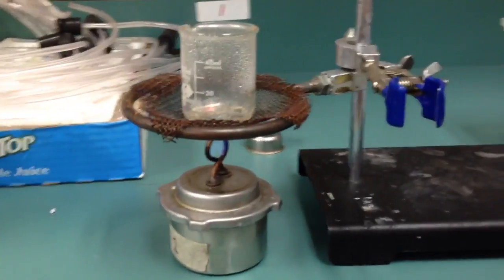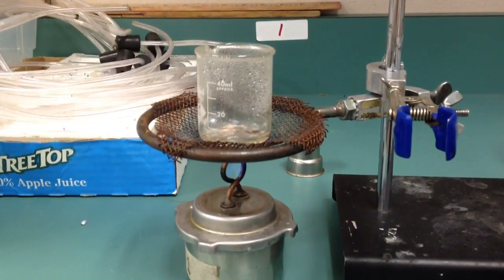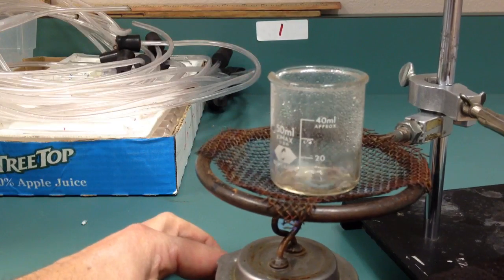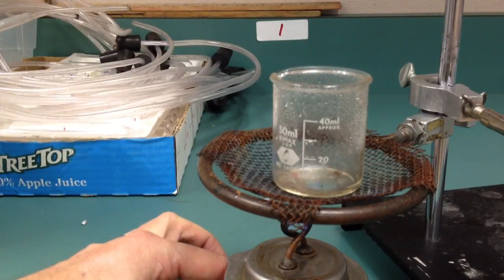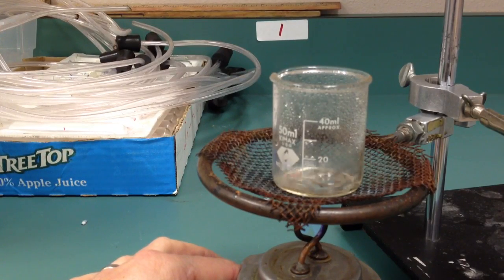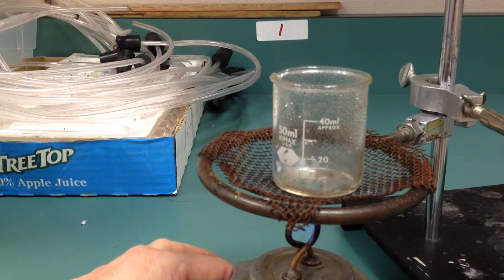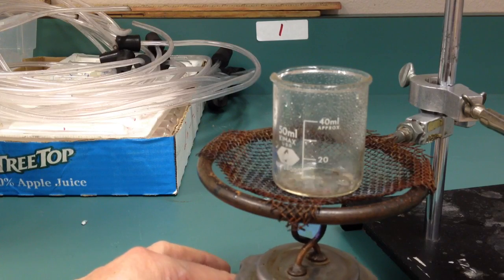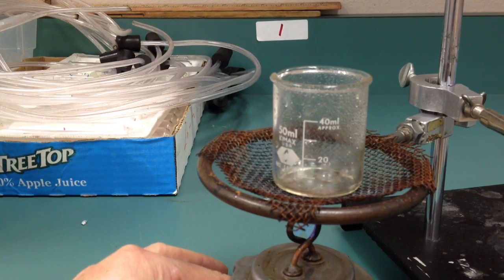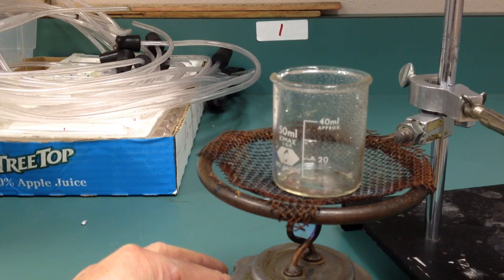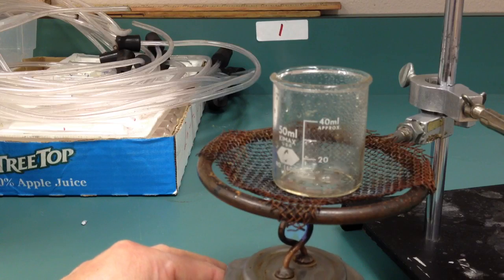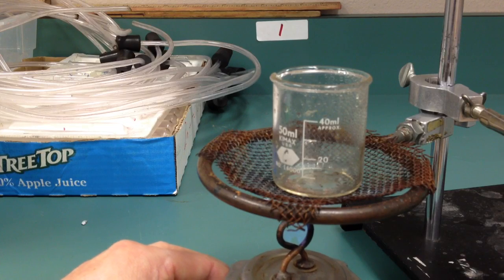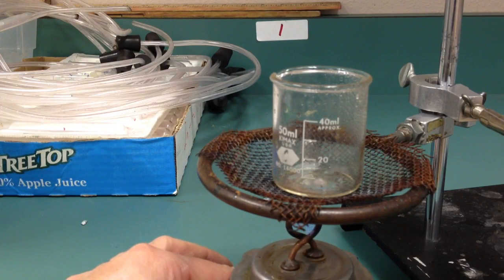Zoom in a little more even if I can. Move this up. Okay, just give it another, I'm guessing about one more minute. And you'll start to see some white powder hopefully forming. So, we just got to get rid of the liquid and the zinc chloride will come out of the liquid. All right, here we go.